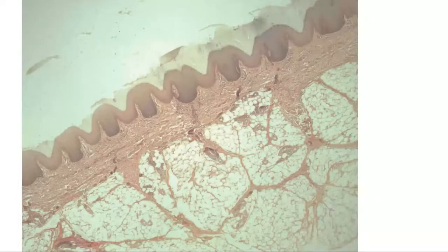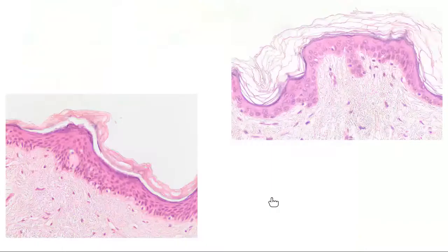Oh, well, so here's the slide we looked at before, right? Check out that big hypodermis right there. So that's the image we looked at before. Let's zoom in on the epidermis layer up here at the top. These are a couple of pictures from our slides. I believe you had a space in your packet to draw what the skin looked like. These are a couple of things you'll find in the guided lesson.